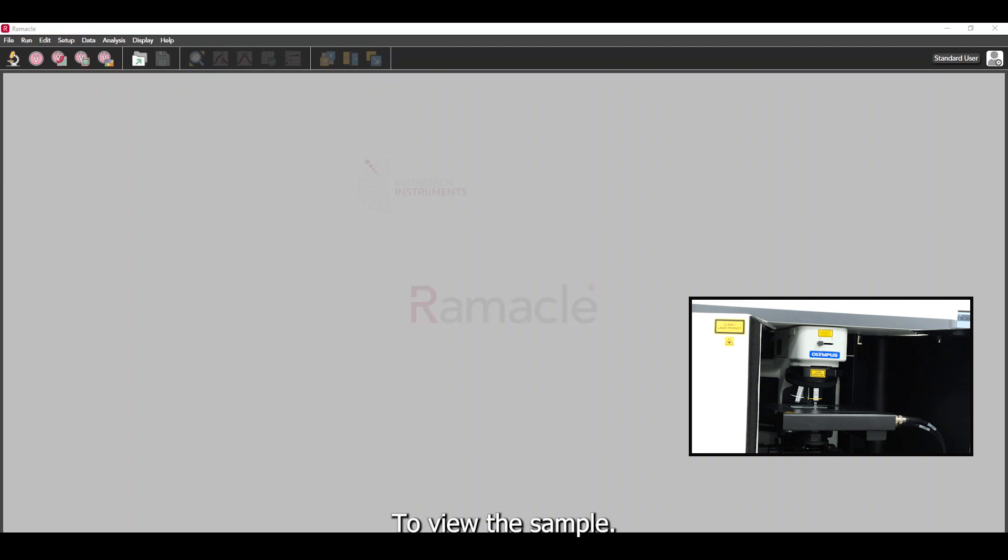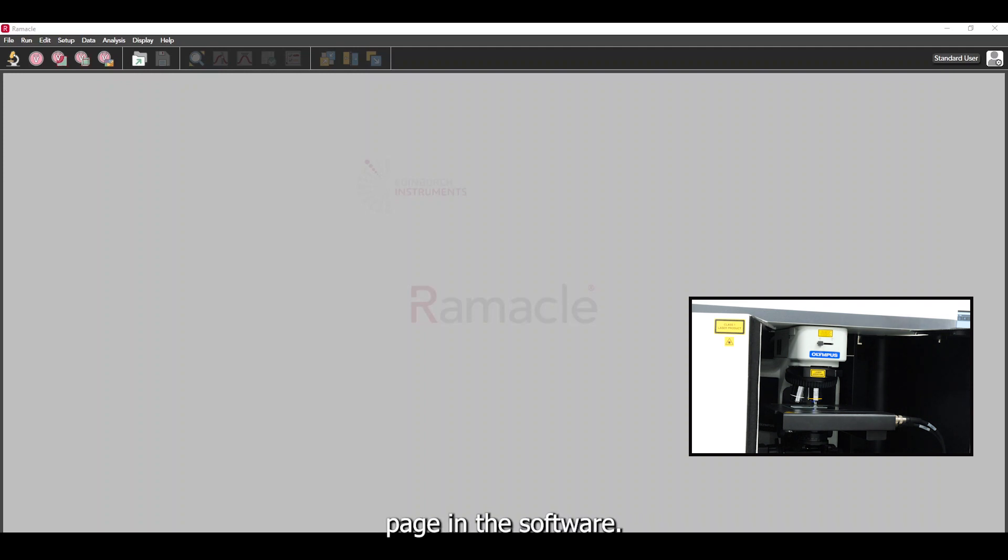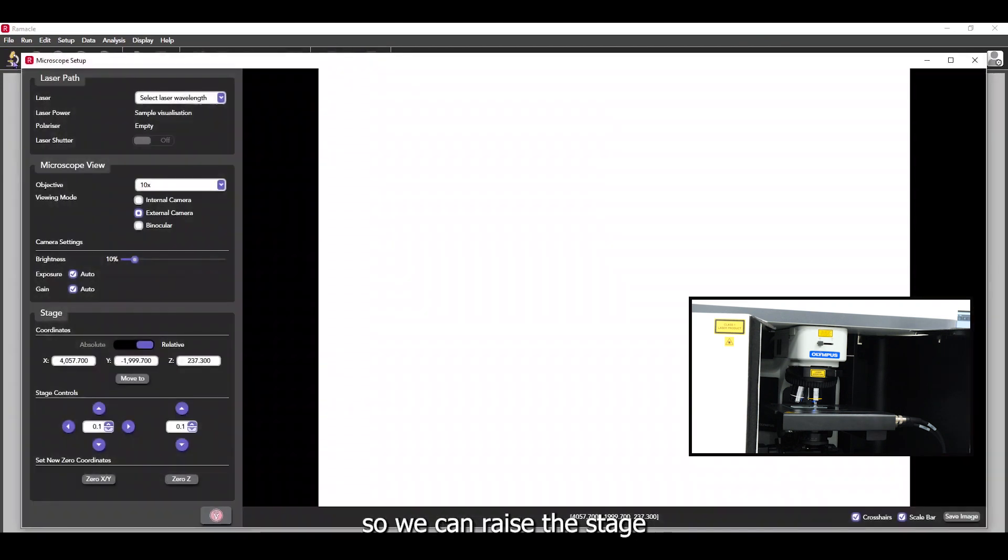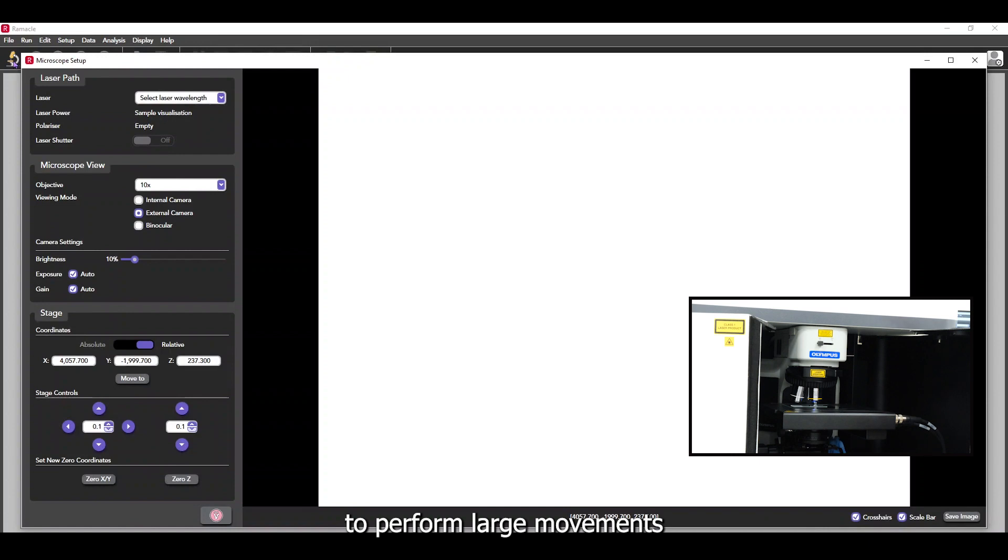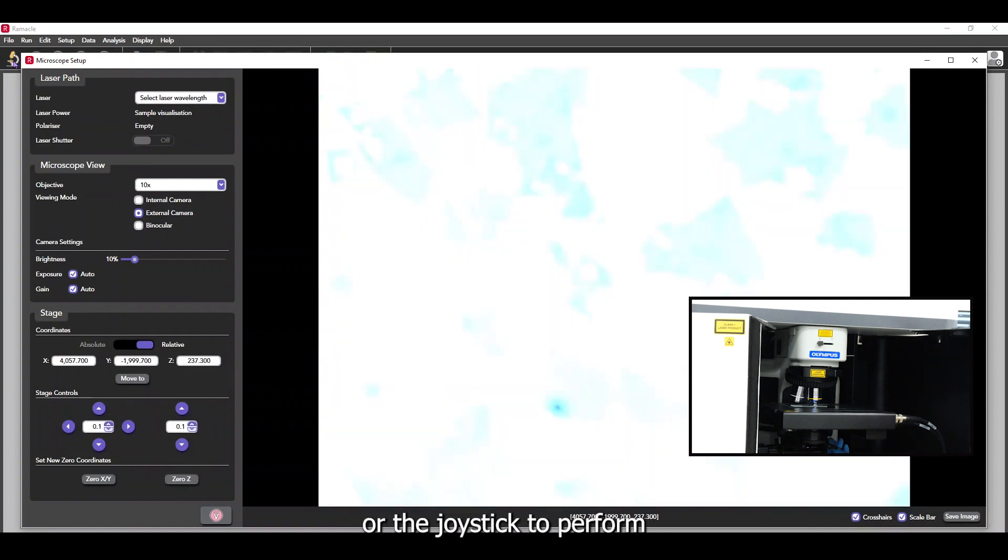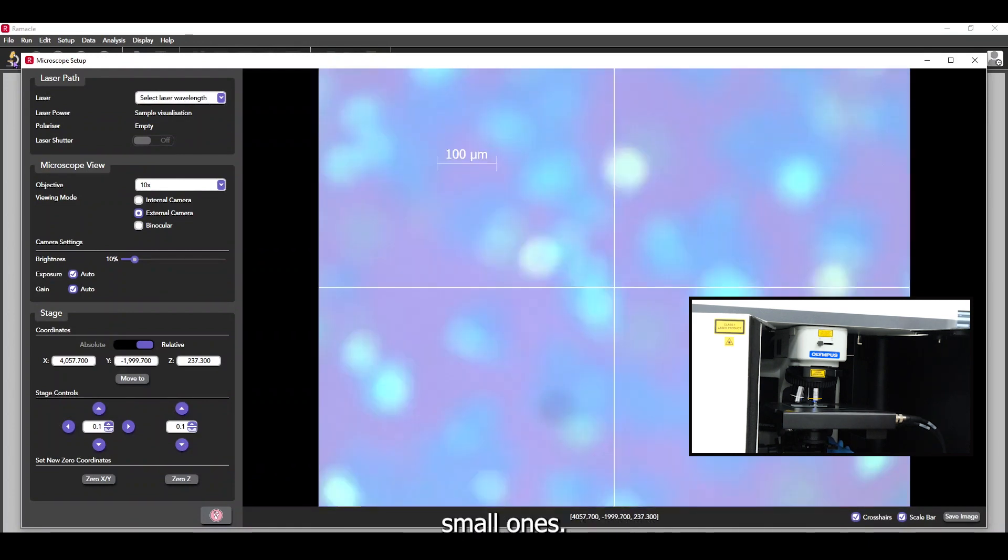To view the sample, we can open the microscope page in the software. The sample will initially be out of focus, so we can raise the stage to view it. We can use a coarse adjustment wheel on the stage to perform large movements and a fine adjustment wheel or the joystick to perform small ones.